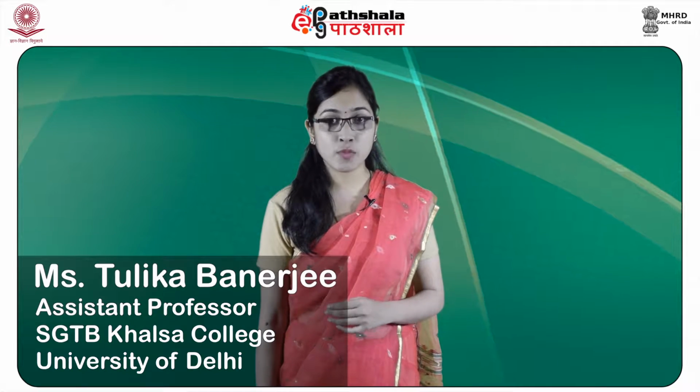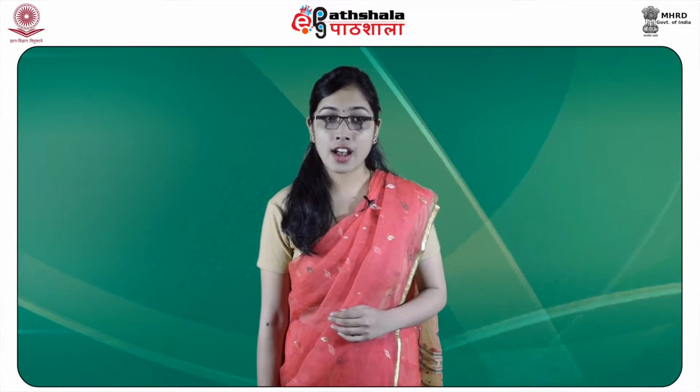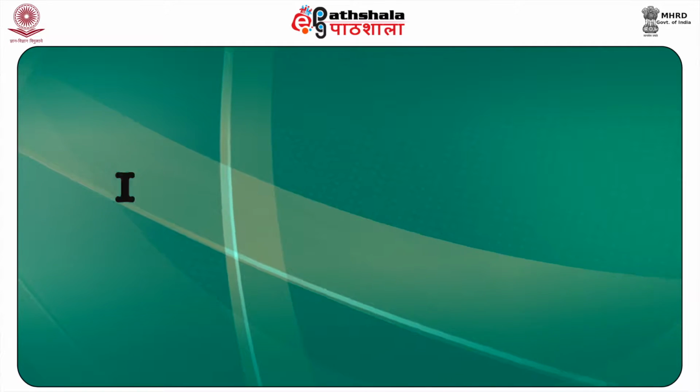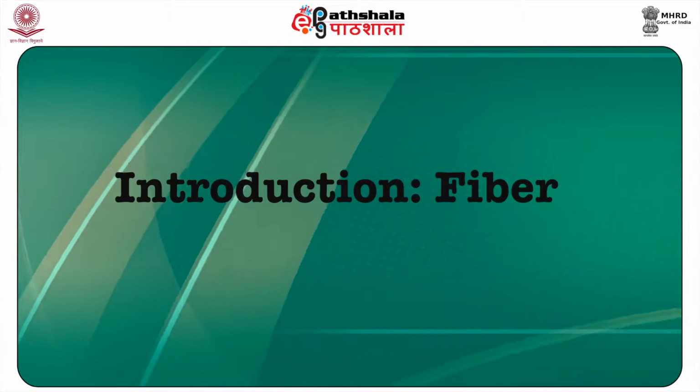After studying this module, you shall be able to know what is fiber, how the source of the fiber can be identified, what is the importance of fiber examination, and what are the instrumental techniques used for fiber analysis. Let us start with the introduction of fiber.